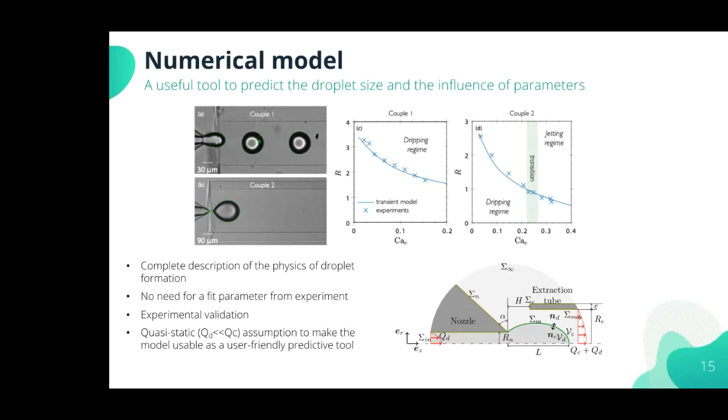Then we developed an original numerical model to describe the droplet formation in this non-embedded co-flow focusing case. First, to better understand the physics involved in the formation, but also to get a useful predictive tool, as you will see. I will not go into detail of the model, but I just want to highlight the fact that this model is a complete description of what happens in the droplet, based on the numerical resolution of the Navier-Stokes equation. So no experimental result is needed to find a fit parameter, as in most droplet size scaling law equations.